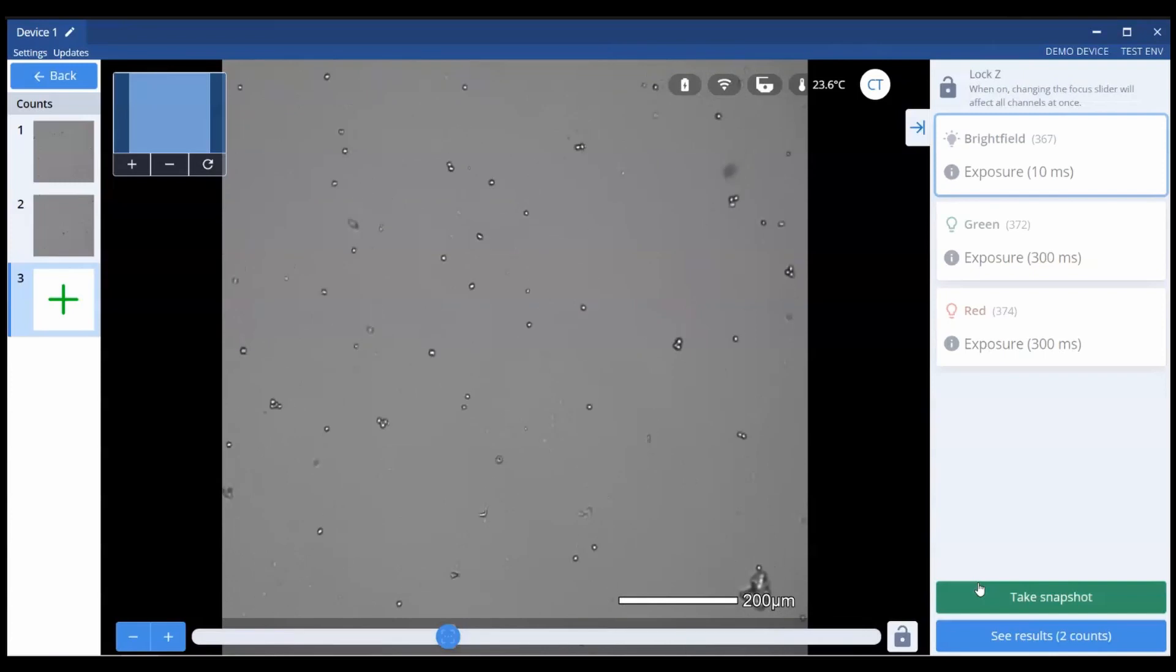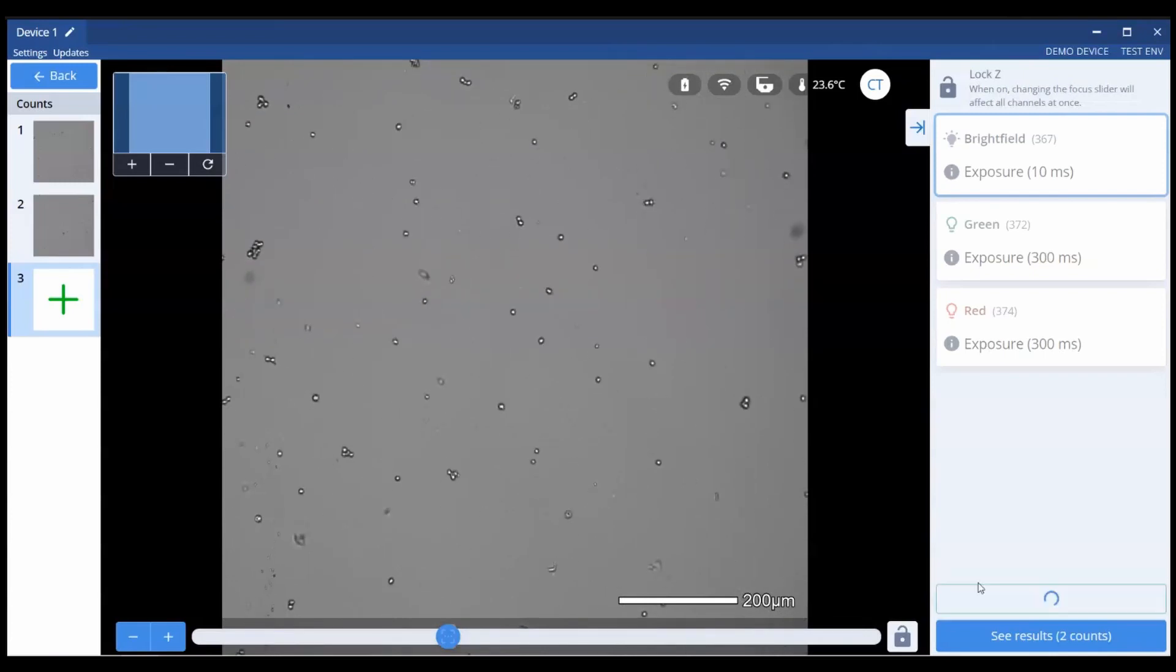Simply move the counting slide to a fixed location and press count to obtain an image.